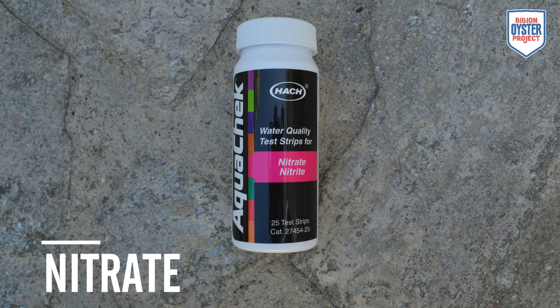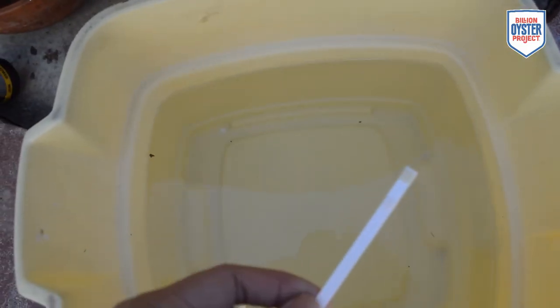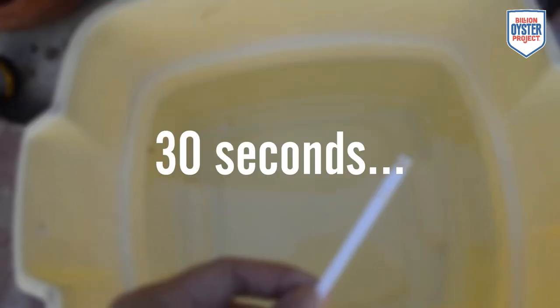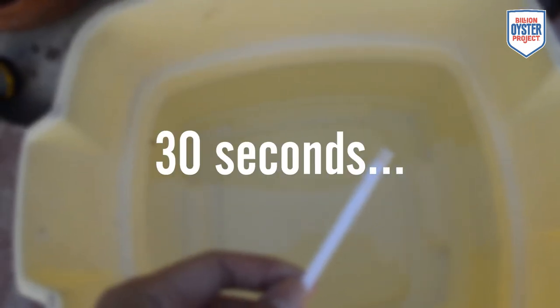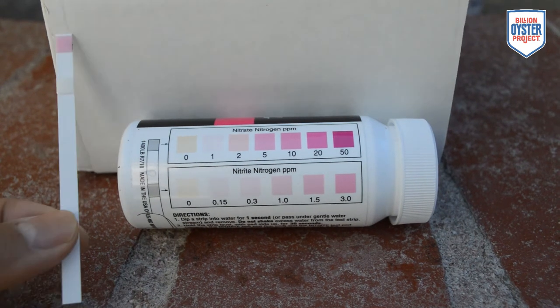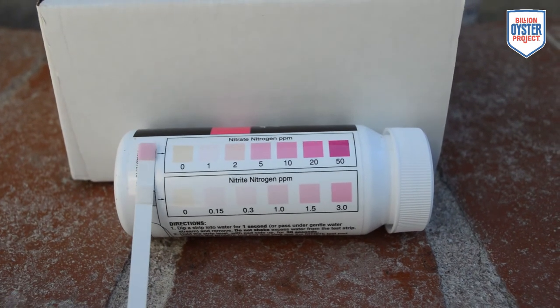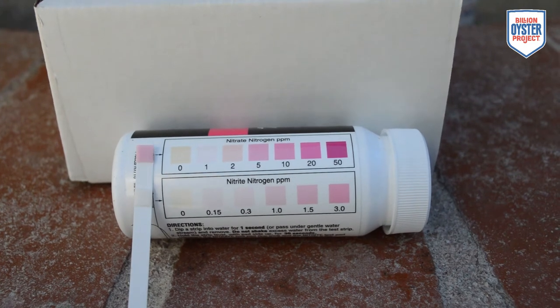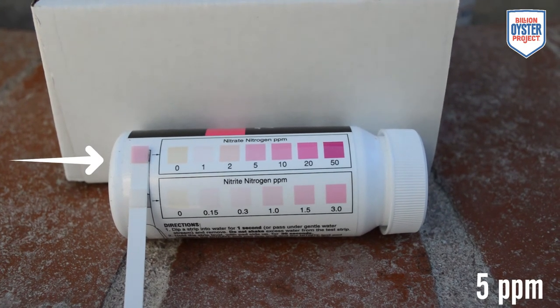To measure nitrates, we will be using AquaCheck water quality test strips for nitrates and nitrites. Dip a test strip into water for one second and remove immediately. Do not shake excess water from the test strip. Hold the strip level with pad side up for 30 seconds. Compare the nitrate test pad, pictured here at the tip of the strip, to the color chart on the bottle. Record the result, and note that this test is in parts per million.